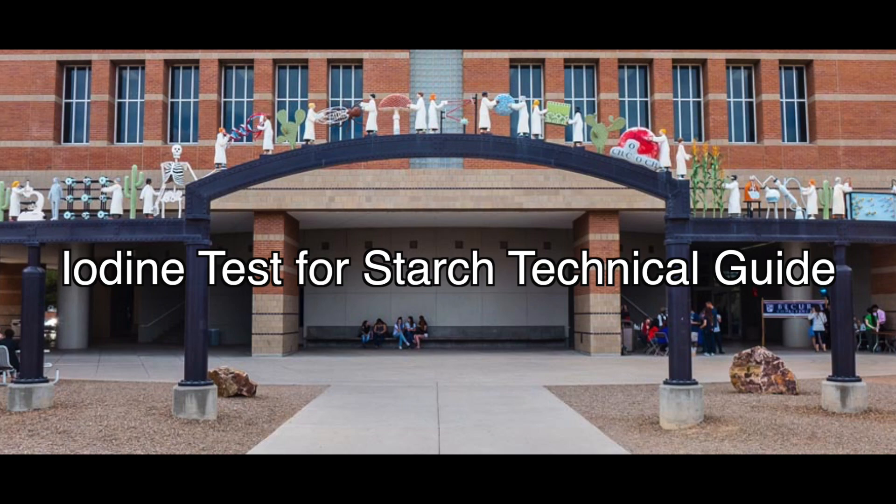In this video, I will demonstrate how to use an iodine test solution to detect the presence of starch.